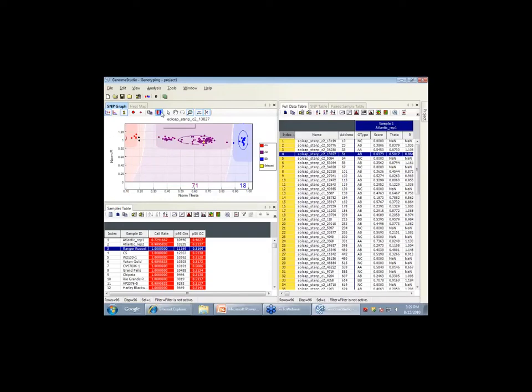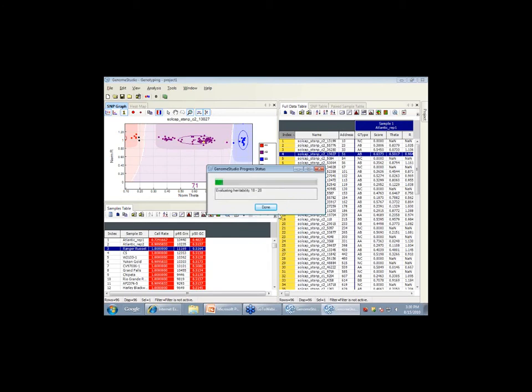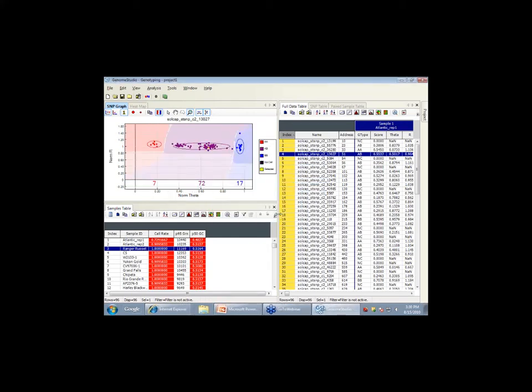I'm going to hit recluster my files back to the automatic. So I'm going to click this cluster all SNPs again, the little three marks over here, hit yes, calculate the data, yep. Notice it went back to the original thing. Okay, so we're back to auto. But that's not what we want to see.